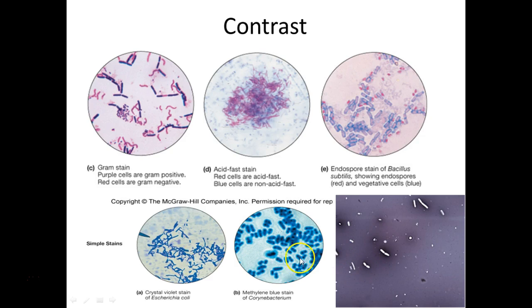It looks blue. And these are blue, right? These are supposed to be blue. And you just see one color, right? Because there's only one organism, and you only used one dye. So you're only seeing one shape. You're only seeing one color.